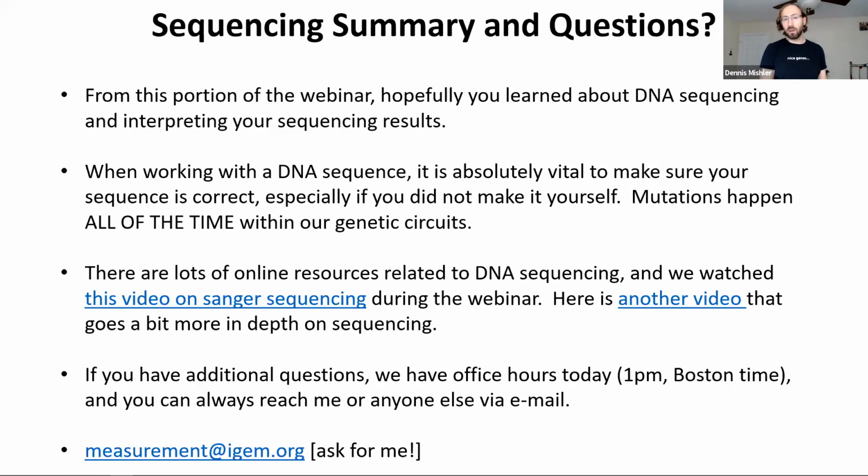What works with bacteria is often very different from what works for eukaryotic organisms, yeast, C. elegans, mammalian cells, all that type of stuff. And you have to use very different procedures based upon the organisms you're working with. So there's bacteria and there's eukaryotes. And within bacteria, there's kind of E. coli and then everything else. So you really just have to be aware of the organism you're using and the differences in the techniques for each organism. Okay.